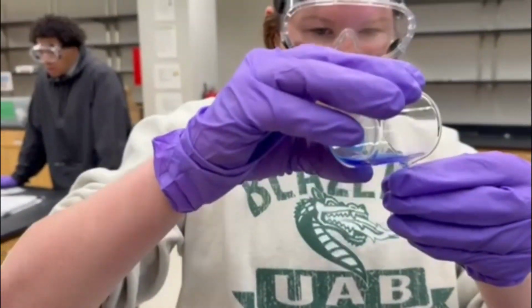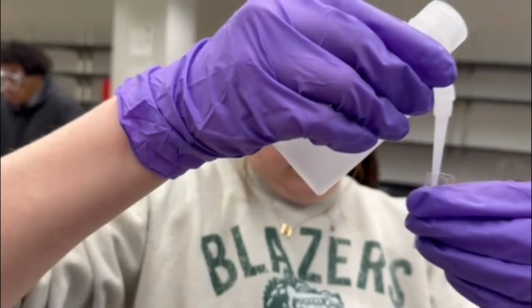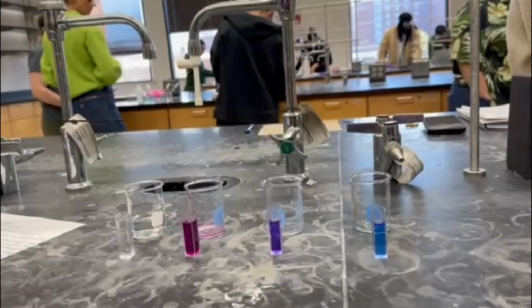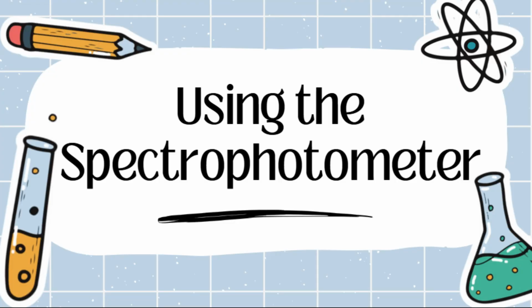Repeat this step for every cuvette until you result in 3 cuvettes of solution as shown here. The clear cuvette is water that acts as our blank. Now it's time to use the spectrophotometer.